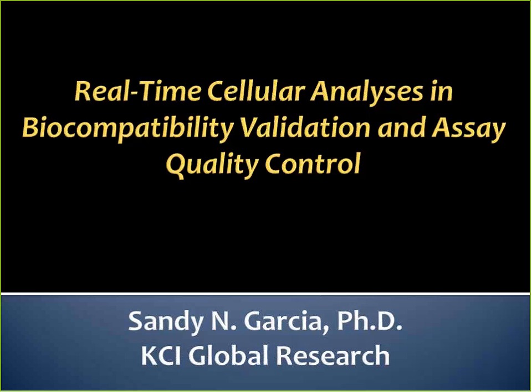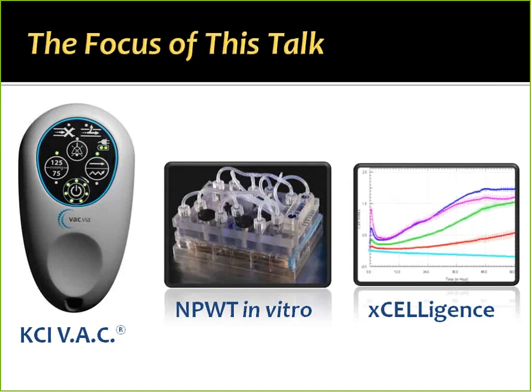It is a pleasure to have this opportunity to talk to you about our experience using the xCELLigence system in biocompatibility testing and also in assay quality control in the medical device industry. As Lena mentioned, I am a cell and tissue culture biologist at KCI, which is a wound healing company headquartered in San Antonio. And today, what I'd like to do is talk to you about three things.